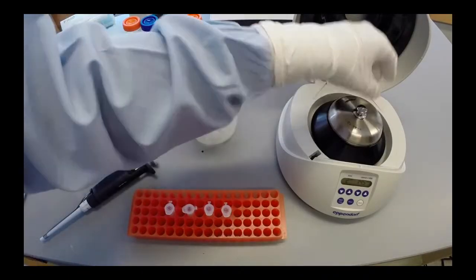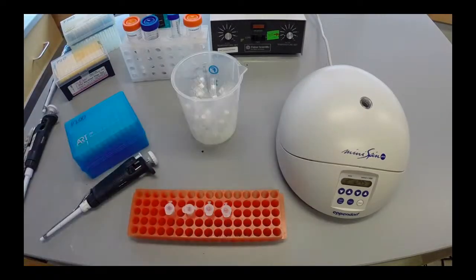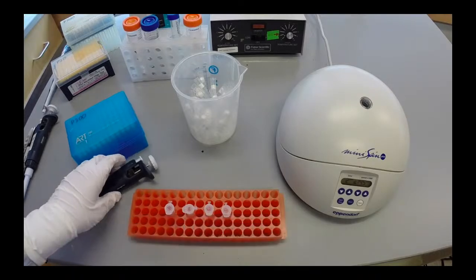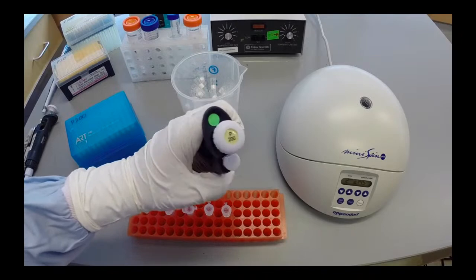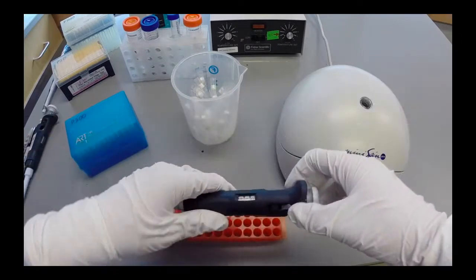In this step, the pellet still contains the DNA, and it is important to remove as much supernatant as possible without disturbing the pellet. So remove and discard the supernatant using the P200 for precision. This will take 2 or more draws.